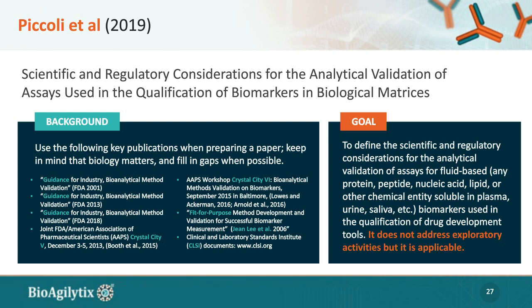I do want to make one thing clear. The intention of this paper was to come up with a bioanalytical assay validation for clinical biomarker qualification. That is very important. The presentation that I'm providing to you is for exploratory biomarkers.